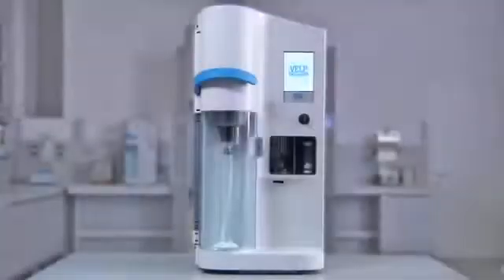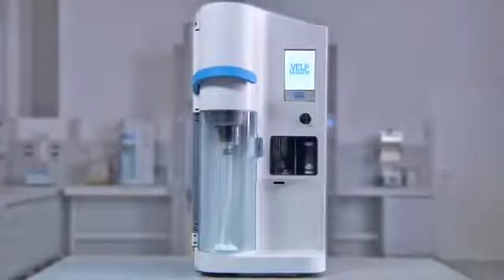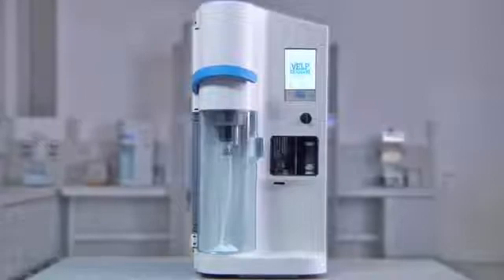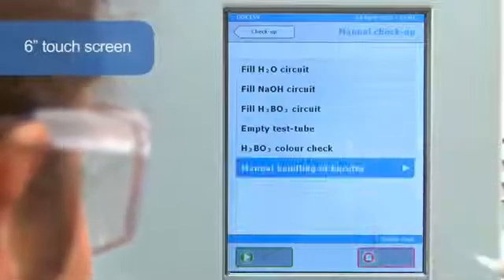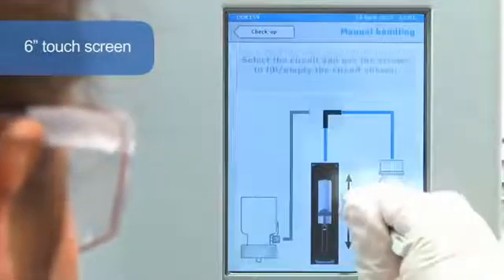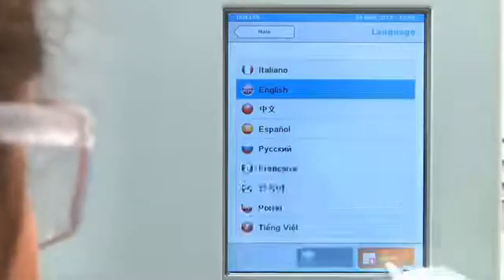The UDK 159 offers the ultimate in capabilities thanks to the extremely precise colorimetric titration and efficient data reporting system. Its 6-inch touchscreen gives information on all of the processes and includes an electronic user guide. The most commonly used languages are pre-installed.